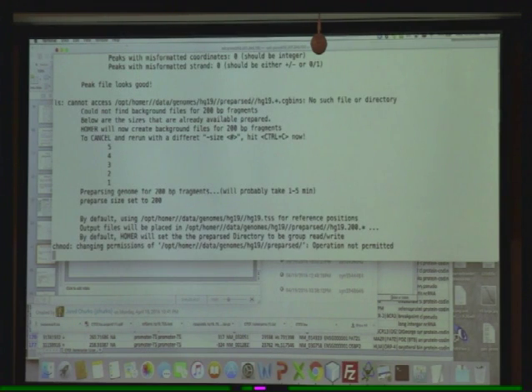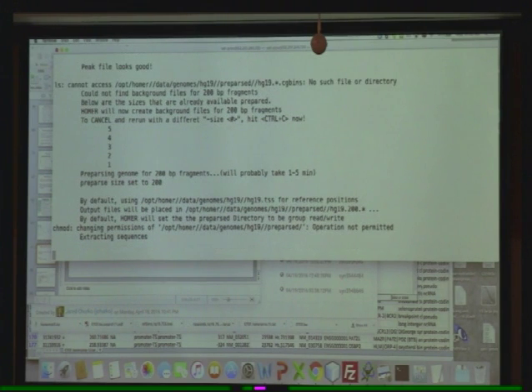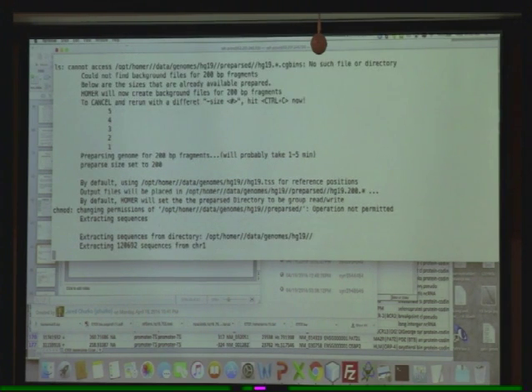I should have done a few more things because this is going to take a while. These are the default values to find the motifs. You're saying find the top 25 motifs that we think it is and where they are located, the de novo motifs. Then it compares them to the known database of motifs and gives you a p-value, and you can comb through that. This does take a long time.